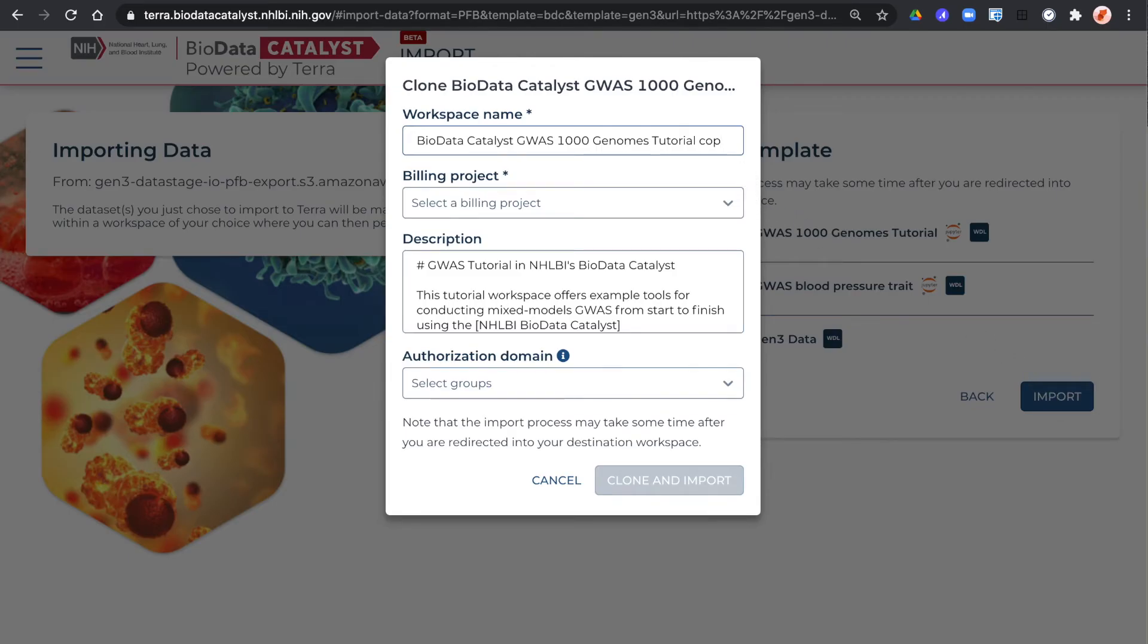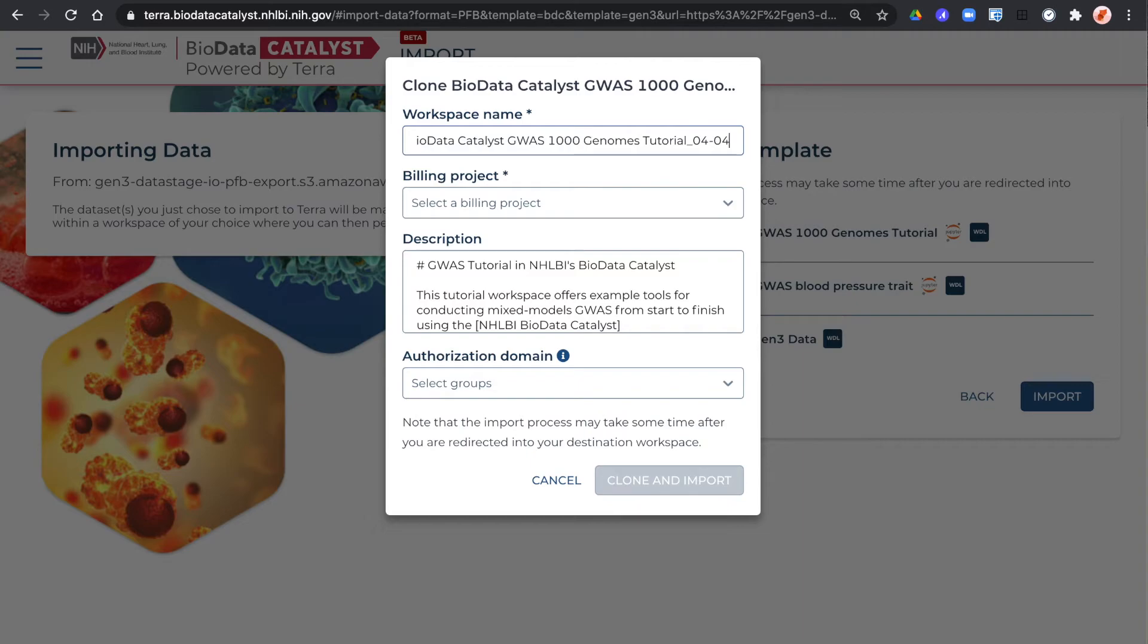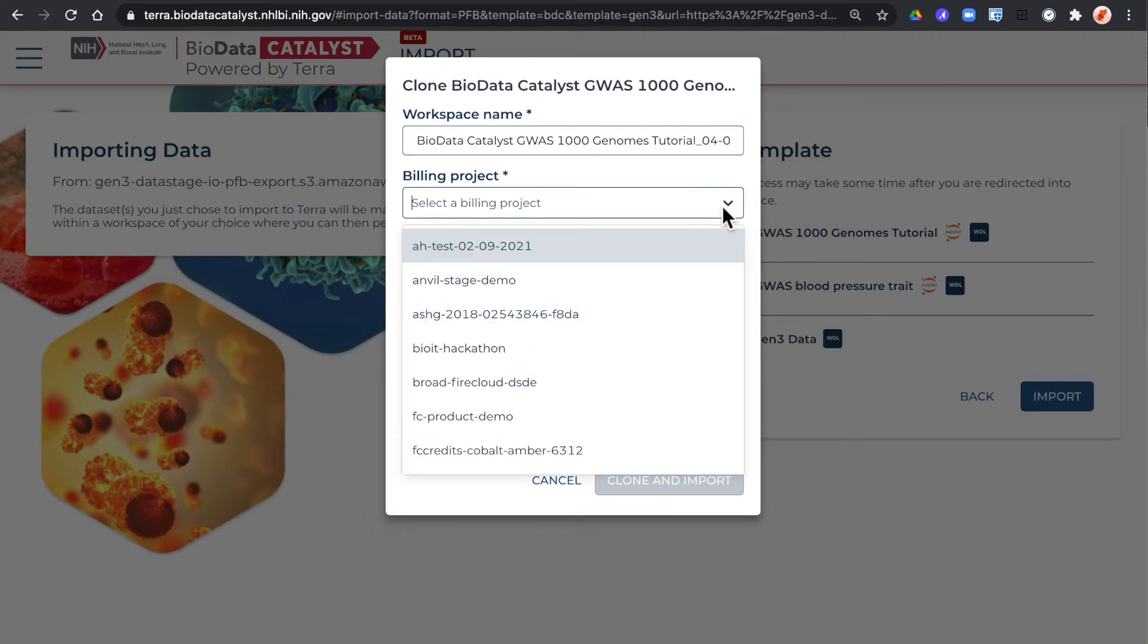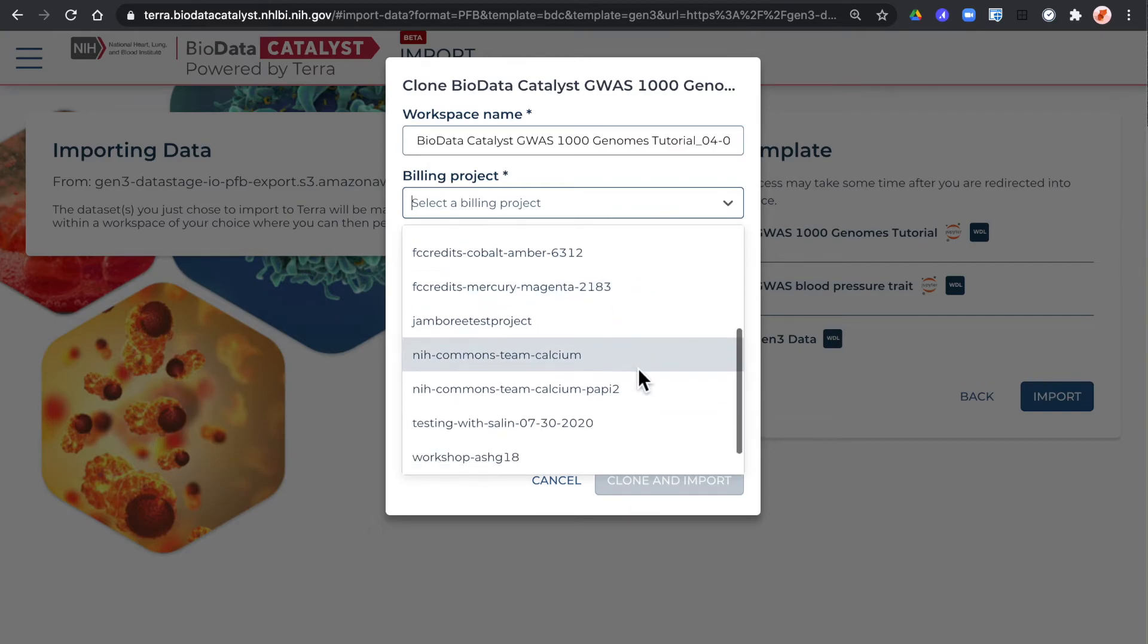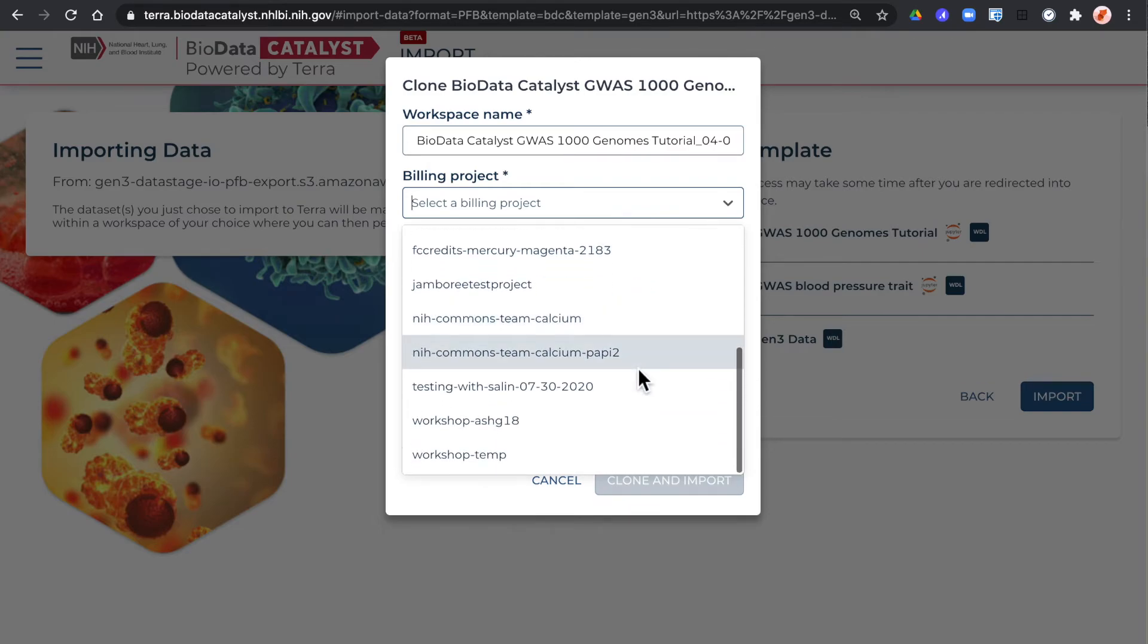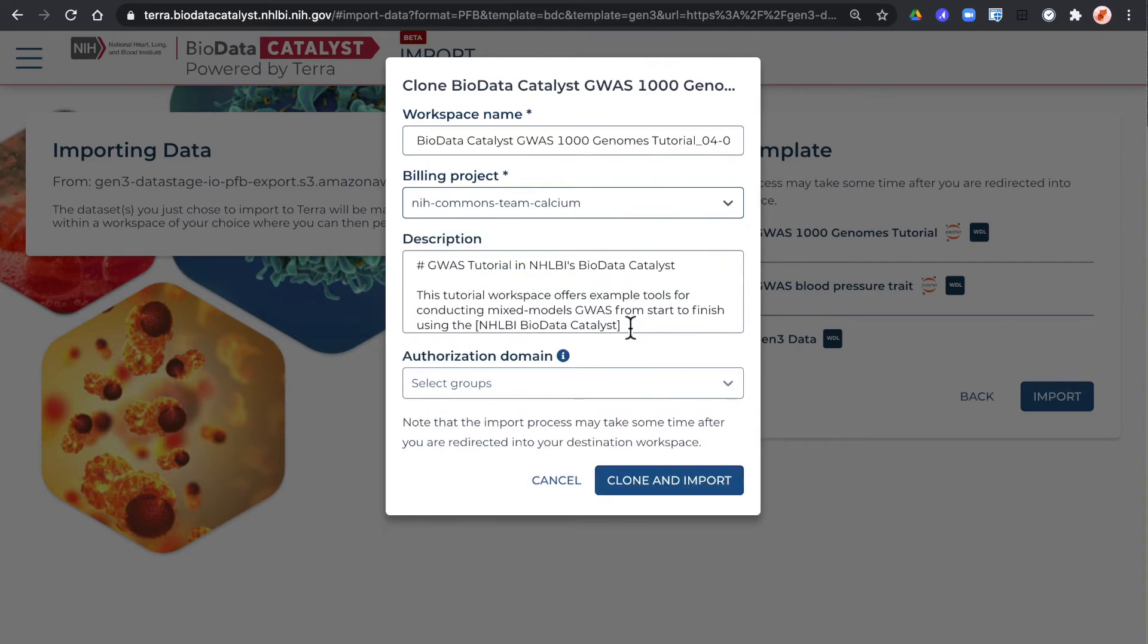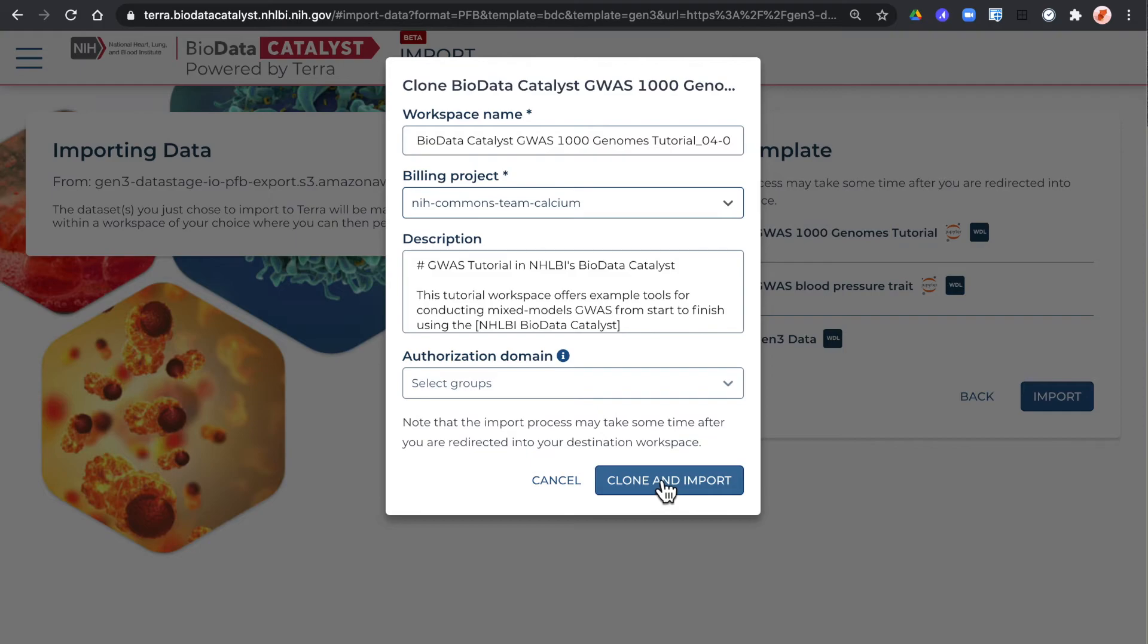You'll need to give your workspace a name and select a billing project. If you're working with controlled access data you'll want to set an authorization domain to protect anything you generate in the workspace. Click clone and import.